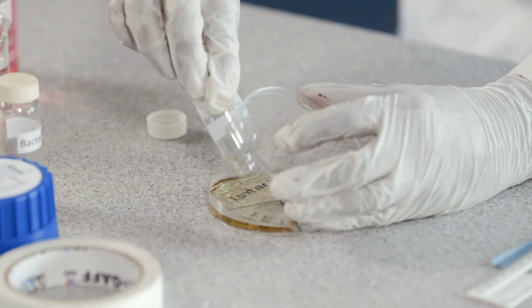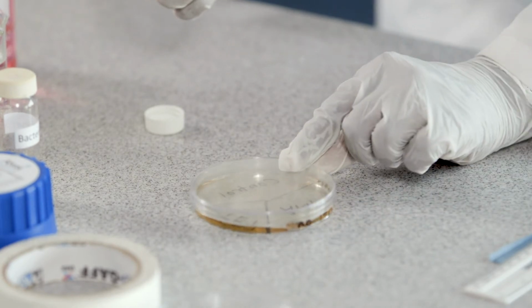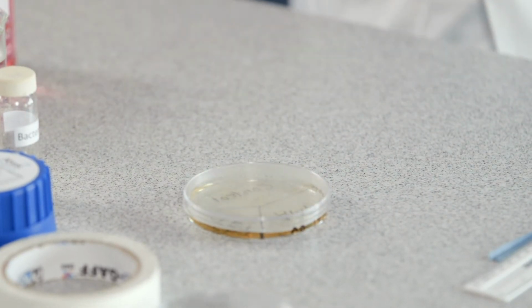Pour enough agar to half fill the depth of the Petri dish base. Replace the dish lid immediately. Leave the agar to solidify. You can also use a pre-prepared agar plate to save some time, or pour the agar plate in pairs. I am now going to demonstrate how to successfully make a bacteria plate.